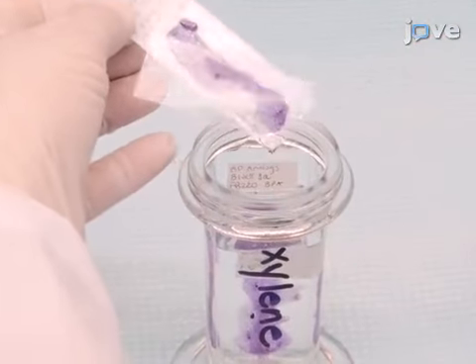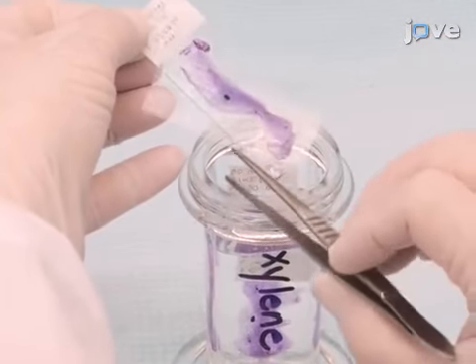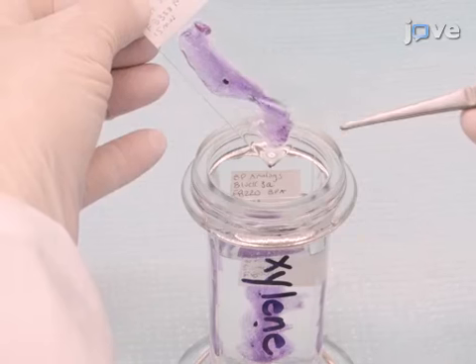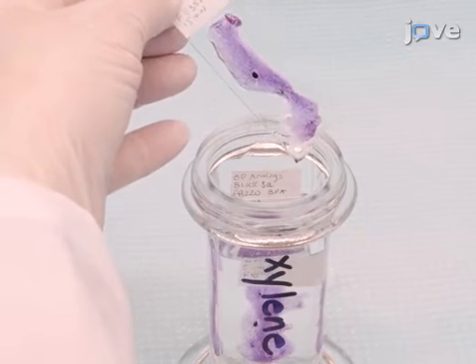Next, with a gloved hand, hold the slide and use a pair of forceps to carefully remove the coverslip in one piece. There may be variability in the ease of removing the coverslip depending on the thickness of the mount.